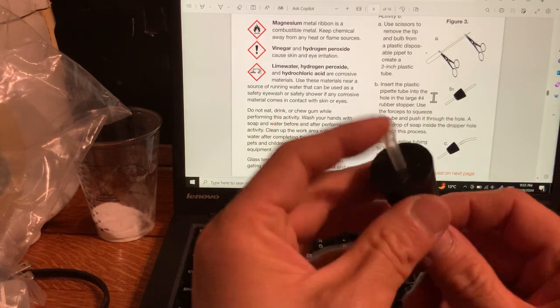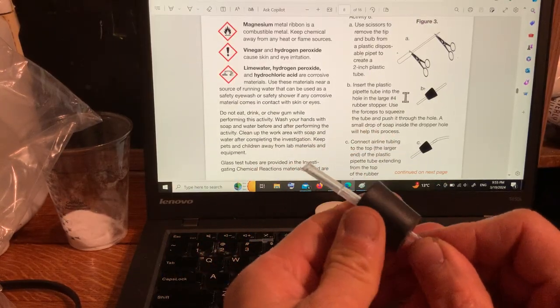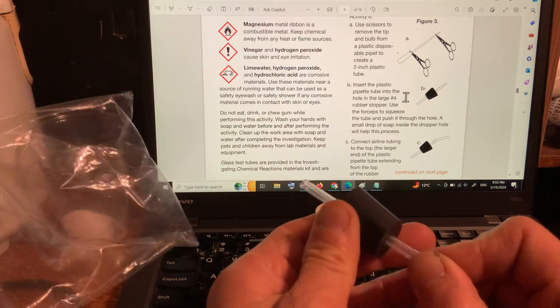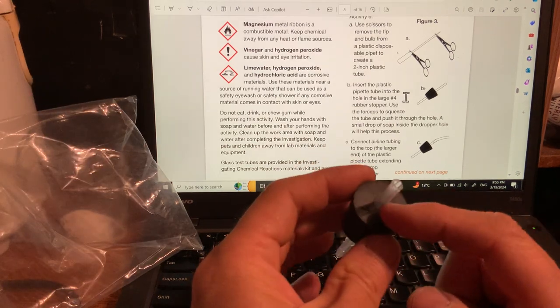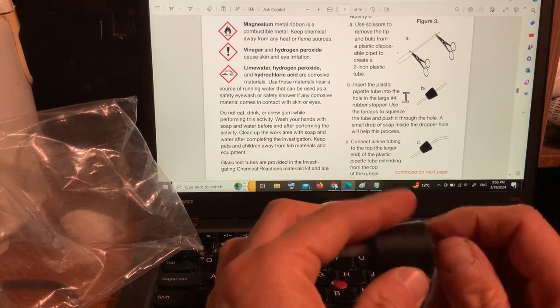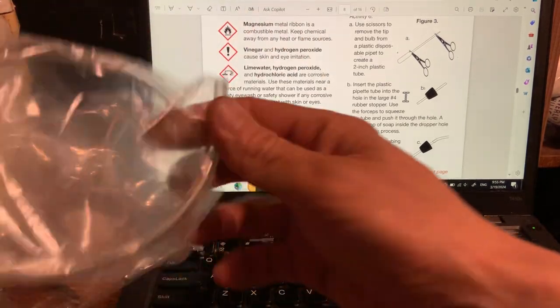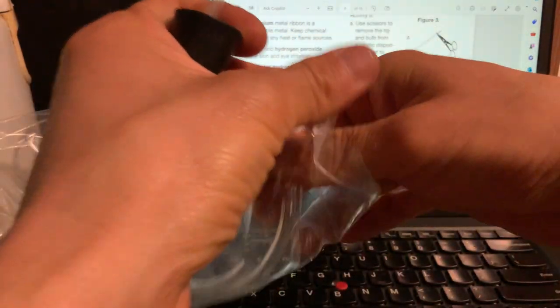Okay. Now, this is not perfect. It's a little bit too easy. That means some carbon dioxide gas might leak through the contact between the plastic and the rubber. But that's okay. I hope we'll get enough gas for the experiment. I'm actually going to do the experiment, so we'll see.